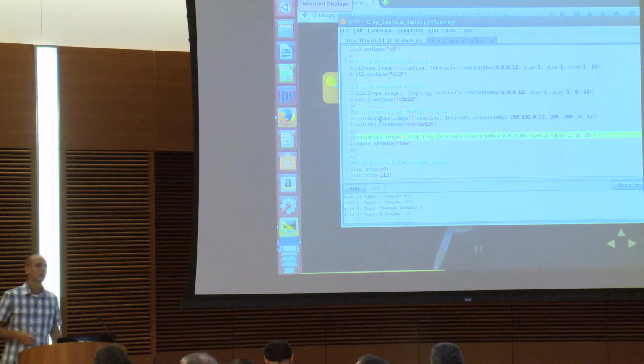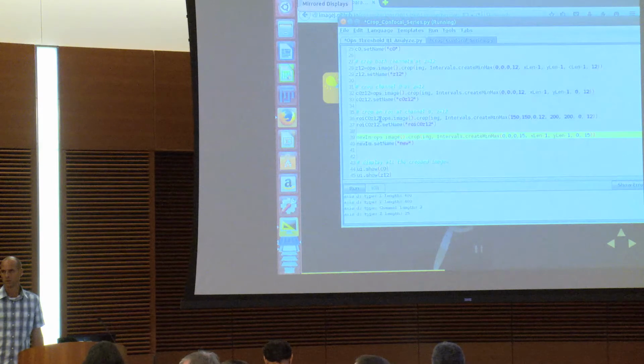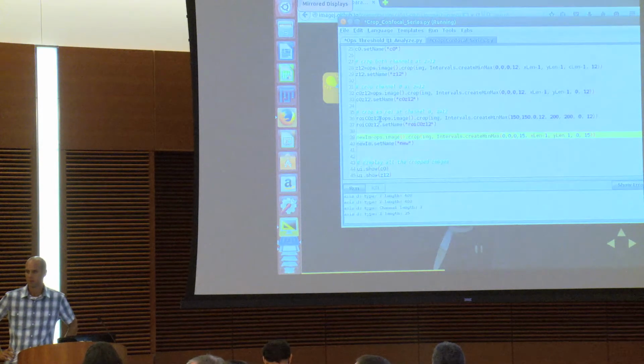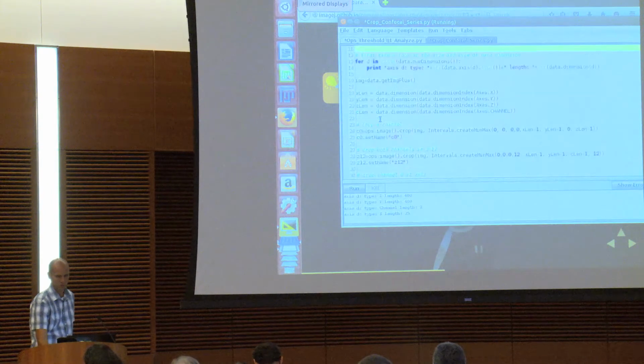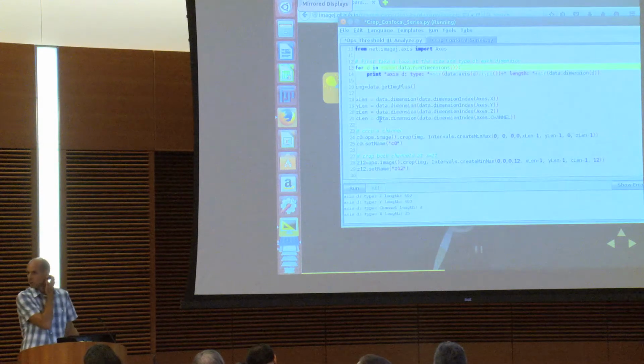You could write a for loop or whatever here to loop over dimensions, create an interval, and set the values somehow. You kind of have to know what bounds you want to crop. For example, we could generalize this right now with the current code. Crop -1 on all dimensions, right? But it would be harder to understand. So yeah, there's that intervals thing in there.